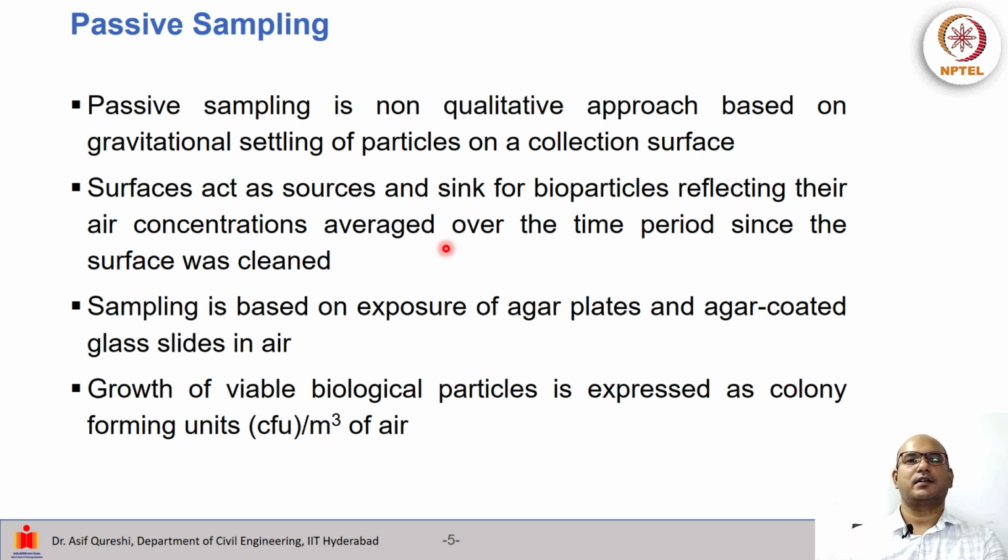So if we make the collection for one day, then whatever we get is sort of a reflection of the air concentrations or air contamination over that one day period. So the surface acts as sources and sinks for bioparticles, reflecting their air concentrations averaged over the time period since the surface was cleaned.